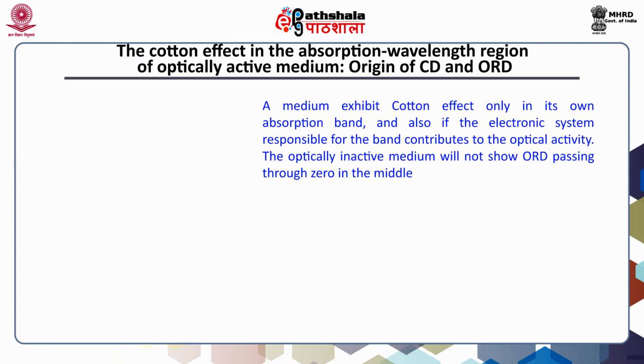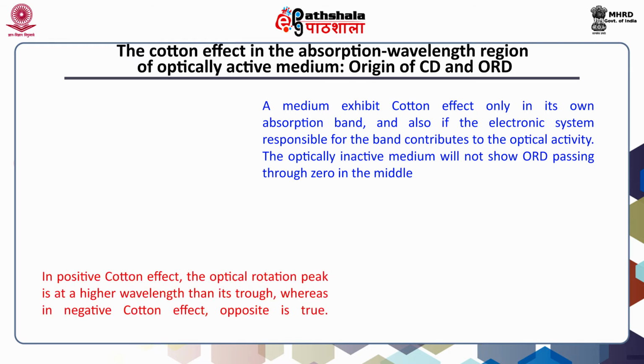Here it is important to note that this happens only in the absorption band of an optically active medium. In an optically inactive medium, there is no such phenomenon. Both the lights are absorbed to the same extent, and hence the difference between the two lights will be zero when they emerge out of the optically inactive medium. An optically inactive medium or a mixture of optically active media does not show differential absorbance of the LCPL and RCPL components. So this is the hallmark of only an optically active medium.